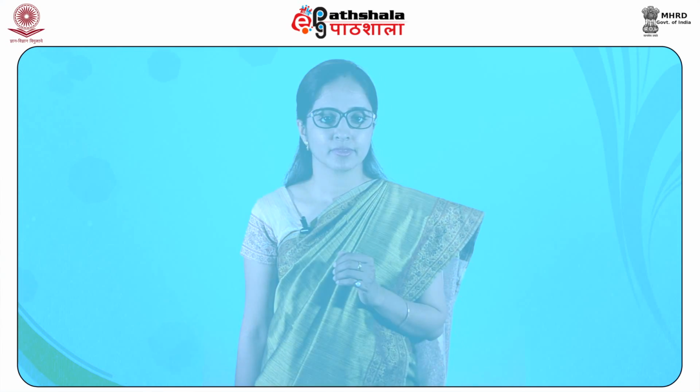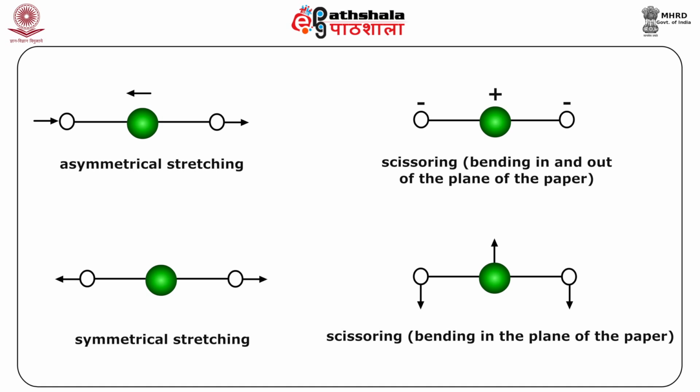Thus, degeneracy is achieved. This effect is greatest when the frequencies match, but it is also present when there is a mismatch of a few tens of wave numbers. The two bands are referred to as a Fermi doublet. For example, Enrico Fermi showed this particular example in the case of carbon dioxide, which is a linear molecule and has 4 fundamental vibrations, but actually it shows only 2 bands, that is at 666 centimeter inverse and 2350 centimeter inverse.